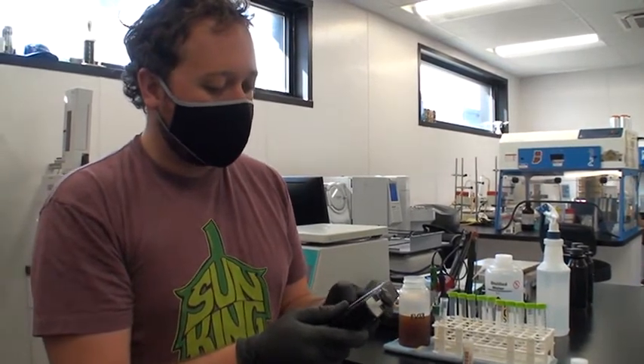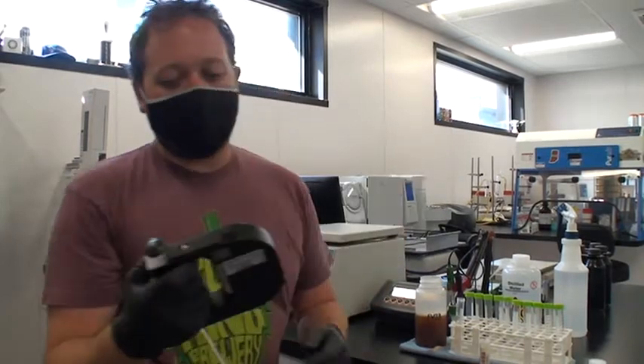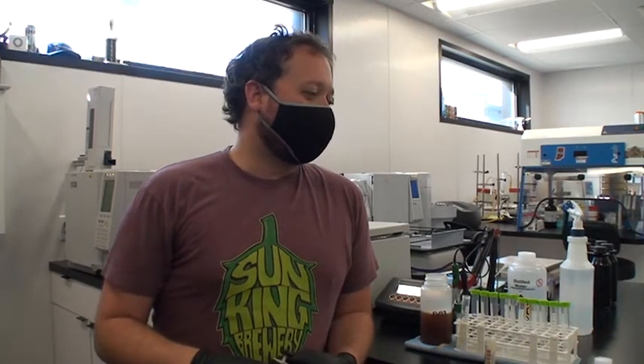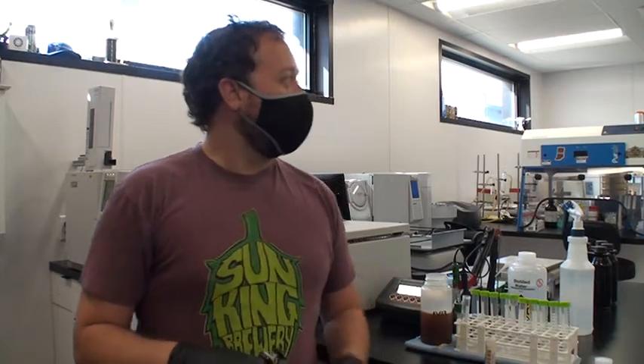Every beer is checked for pH and gravity every day during fermentation. Once a beer has the same gravity for two days in a row, we call it done. For lagers and Belgian beers we do closer to three days just to make sure — some Belgian beers will trickle down slowly over two or three weeks. That's where your fast ferments come into play. Do you still do forced fermentations? Yeah — there they are right over here.